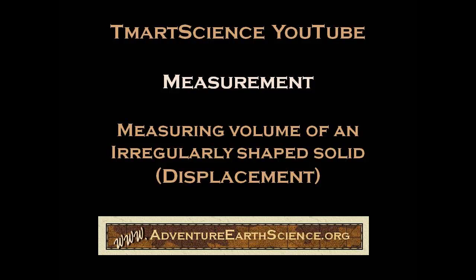In this screencast, I want to show you how to measure the volume of an irregularly shaped solid.